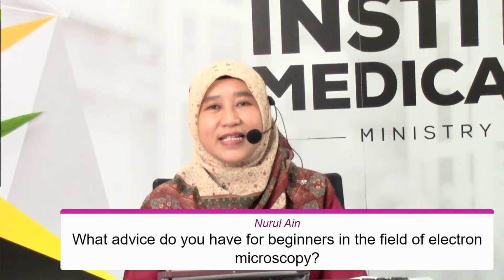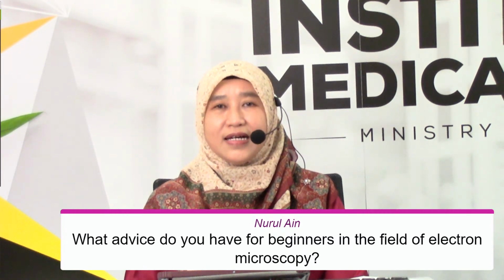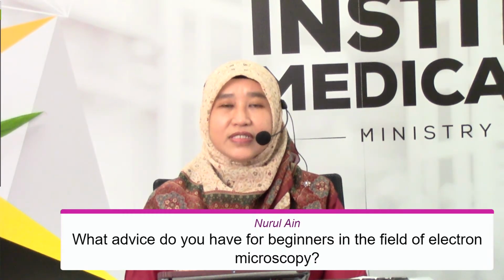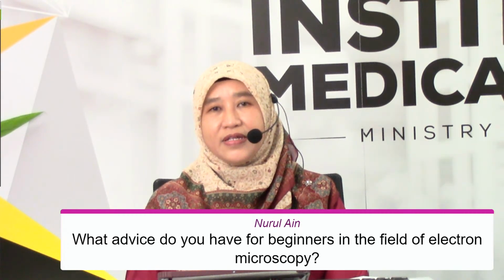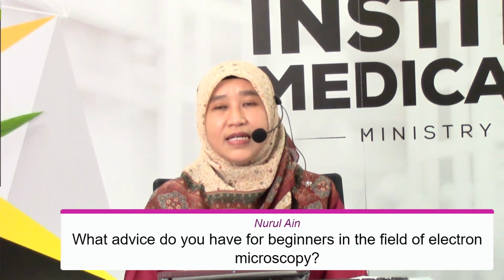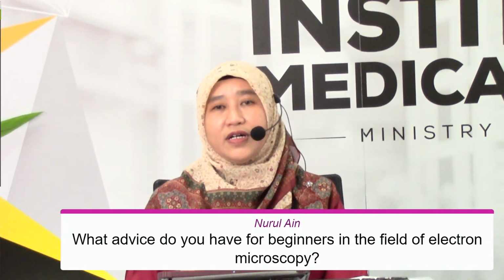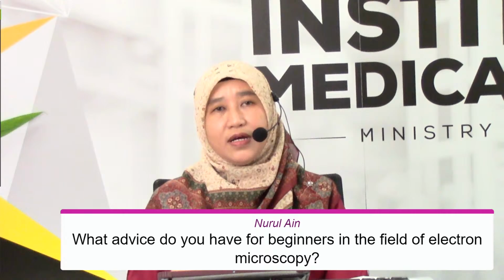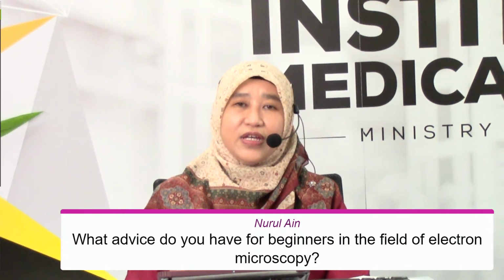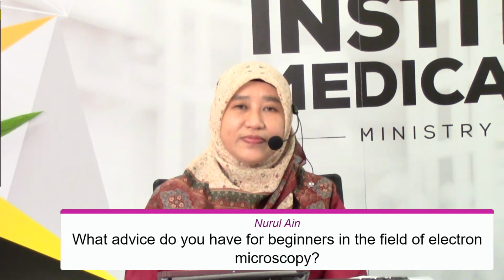I don't want to scare you all, but this is based on my experience. You have to understand the handling of the equipment, because in EM every type of sample is different. The processing and the handling of the equipment, everything is customized to the sample type, and within the same sample type it is also customized to the condition of the sample. Extensive training is needed. Thank you.